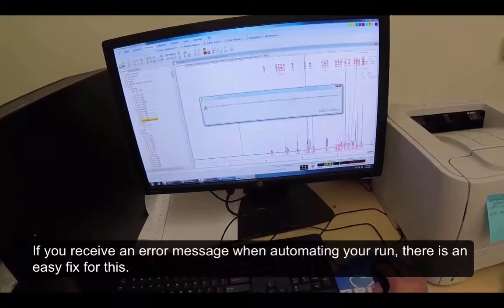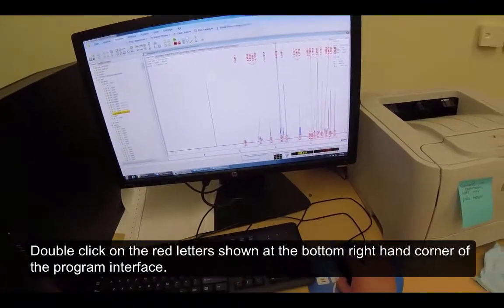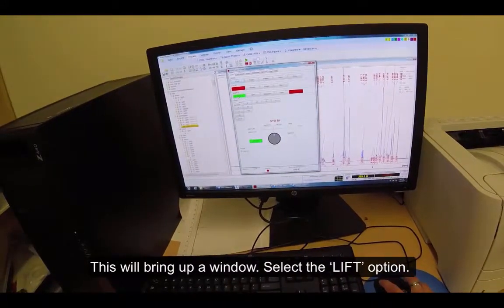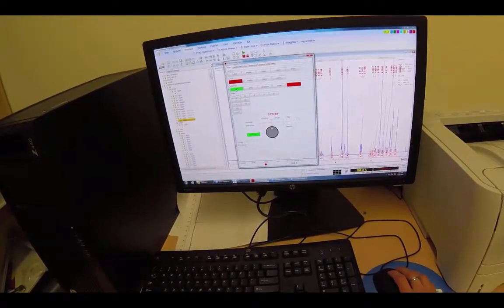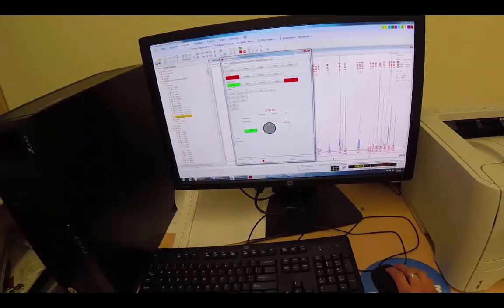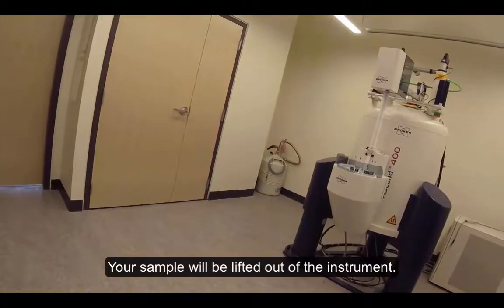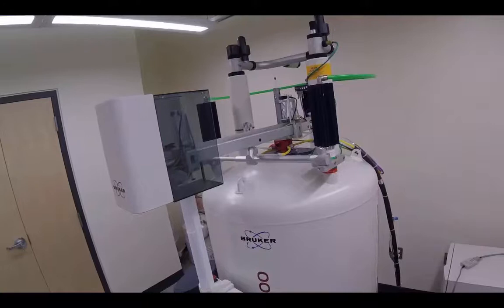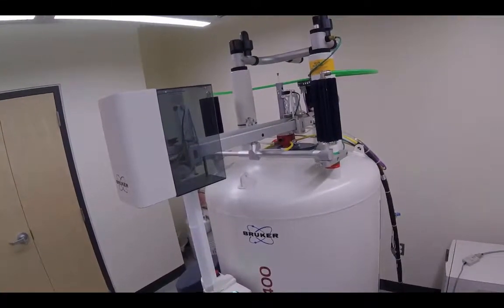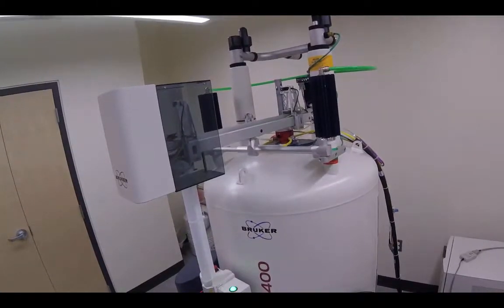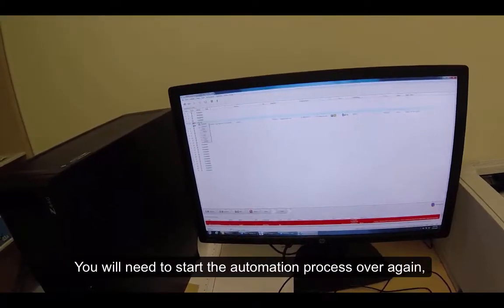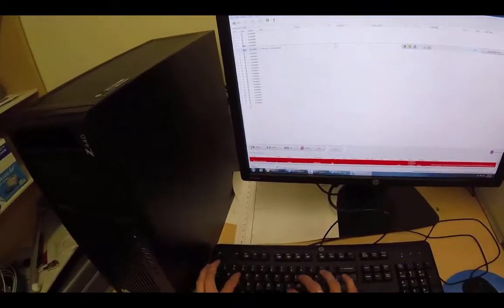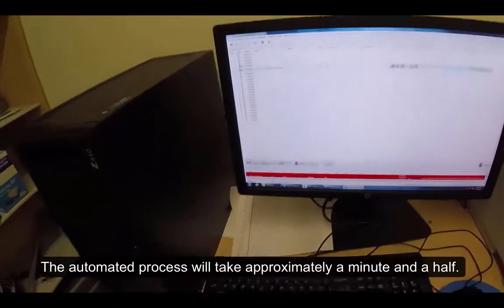If you receive an error message when automating your run, there is an easy fix for this. Double click on the red letter shown at the bottom right-hand corner of the program interface. This will bring up a window. Select the Lift option. You will need to start the automation process over again, deleting your current automation credentials and treating this as a new run. The automated process will take approximately a minute and a half.